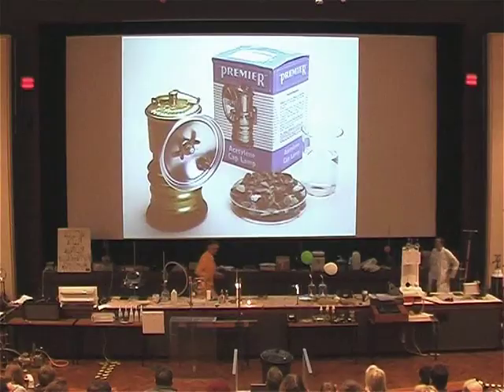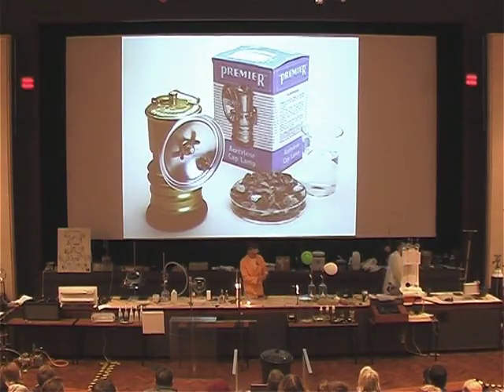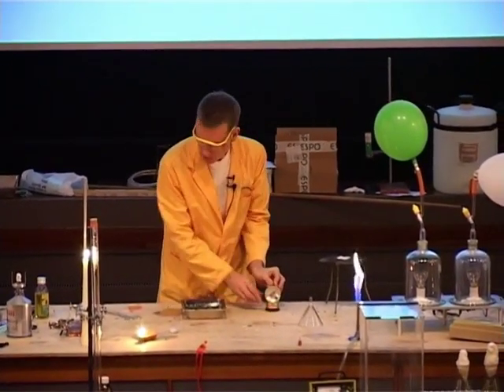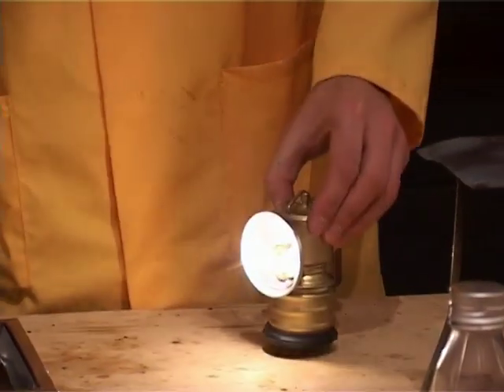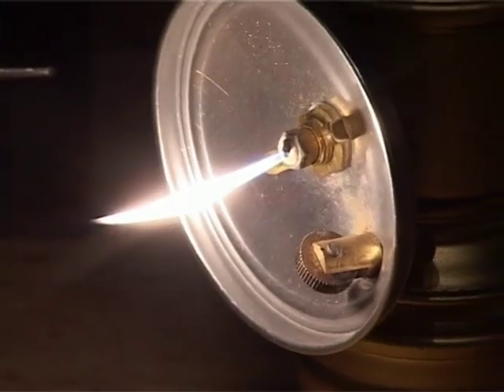Well, ethyne used to be used in portable lamps. So this was before the days of batteries and so on. What did you use on your bike? Well, you used to have a little lamp like this. This is an acetylene lamp here. And the reaction to generate the gas, well, we've got water dropping onto something called calcium carbide. So in the slide at the back here, we see the lamp, and this here is the calcium carbide. Adding water to this gives the gas, ethyne.